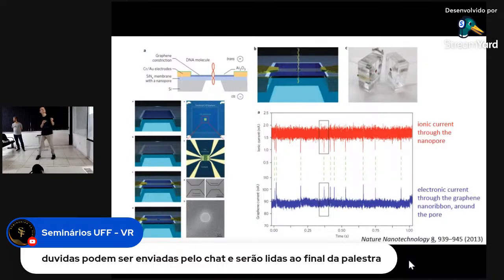So that noise is sharp noise, and the other spikes are the meaning of it. Yes, exactly. It's very nice because they have two different mechanisms. And they have the correlation between them. And there are different levels. That was what I wanted to ask. You are ensuring that the spike over there is related to the DNA, because you have a second information from the electronic channel, right? Right. Yes. There are also other small spikes there that are not shown, but yes.